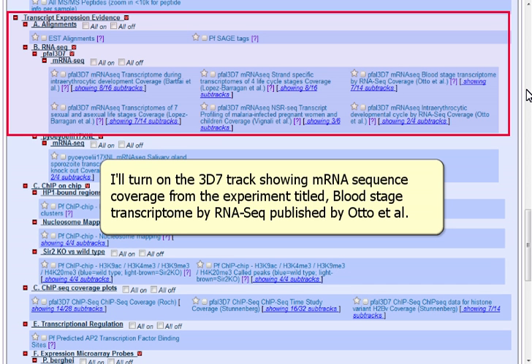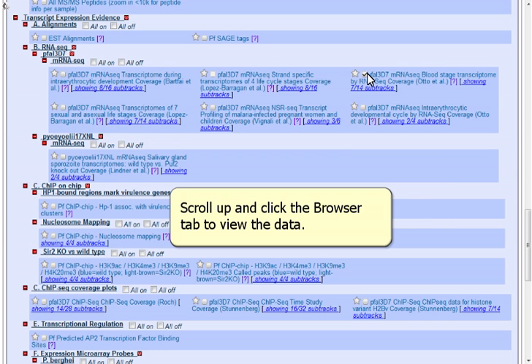I'll turn on the 3D7 track showing mRNA sequence coverage from the experiment titled Blood-Staged Transcriptome by RNA-Seq, published by Otto et al. Scroll up and click the Browser tab to view the data.